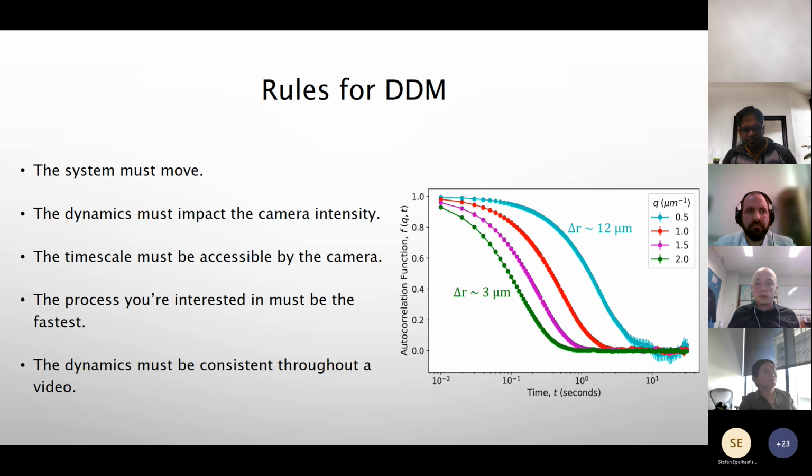Yes, very good. And then, to both of you, before you jump into the rotational and translation, with this kind of particle tracking, I'm pretty sure either your group or somebody might have done the PIV. Has anybody? Yeah. Okay, because it looks like yours is not real time, because there is a processing time for it. So if there is an approach that one can process, what should I say, parallel processing, doing one section, and then another computer or whatever is doing another section, and so on, and then combined together, probably through AI, I don't know. Can we do PIV?